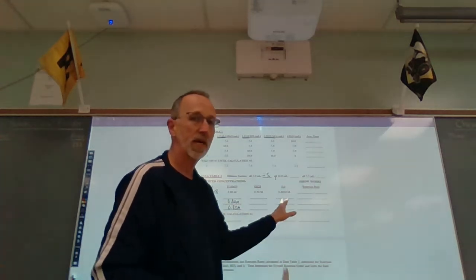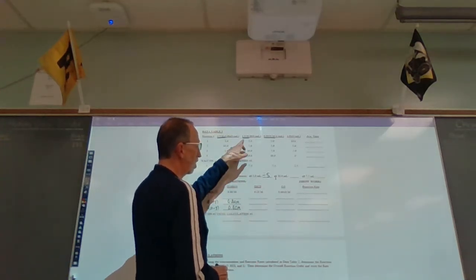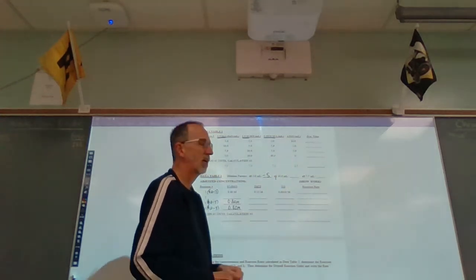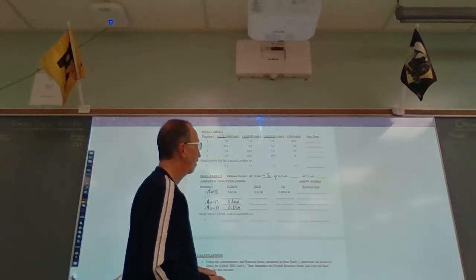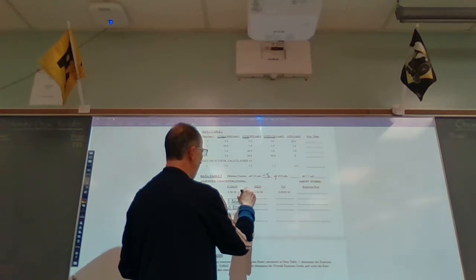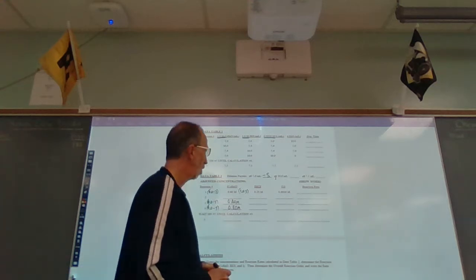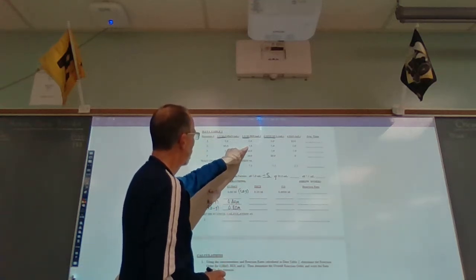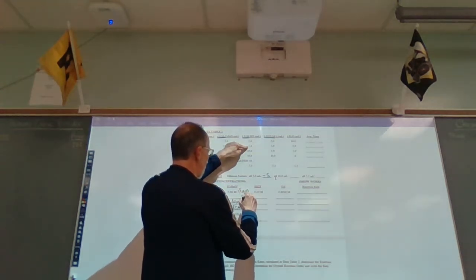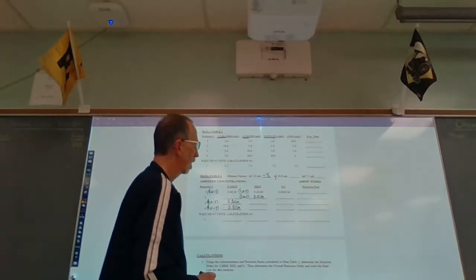And I can do that on the other two columns as well. Here it's already done for us. So HCl started out at 1.0 molar, but when we go from 5 mLs to 25 total and divide that by a factor of 5, 1.0 divided by 5 gives us an adjusted concentration of 0.20 molar. And as I look here in number 2, we also started with 5 mLs. So that would be also 0.20 molar, and that's it for that column.